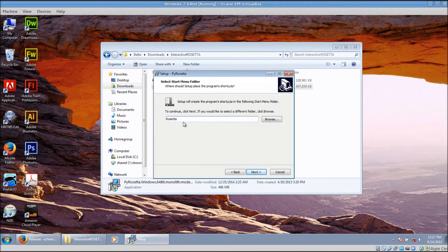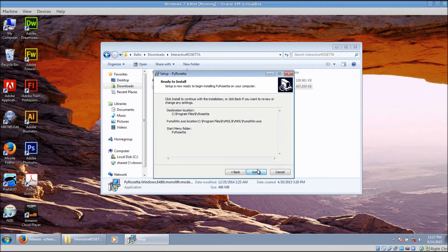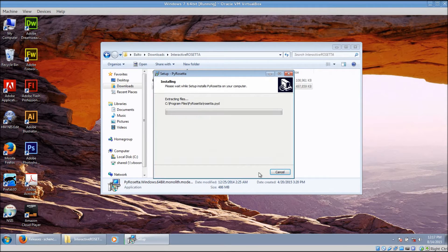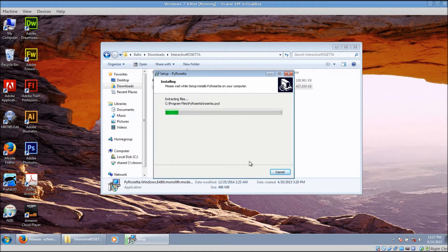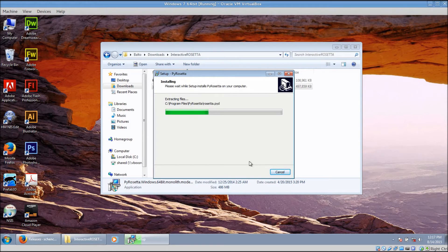I like to rename the folder in the Start menu to PyRosetta instead of Rosetta, but you do not need to change that if you do not want to. It takes a minute or so to install.